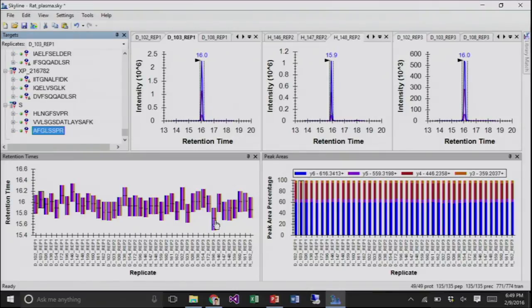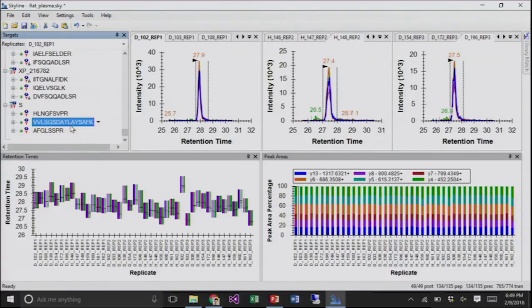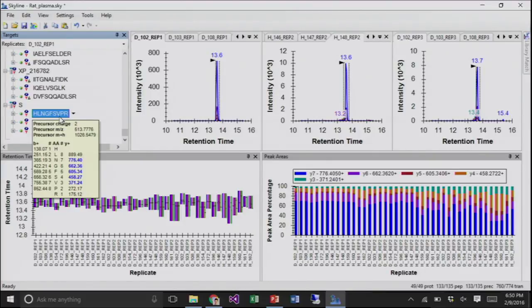If you're a curious kind of person, you might click on this one and go, oh yep, there's really nothing else, so I guess that's it. So that looks okay. Let's look at the next one. Anybody have any issues with how this one's integrated? Maybe look at this other thing that's sticking out. This is again the one that I said is kind of always sticking out. Looks pretty good. Everything's quite good over here. So for the first two, we think things are looking pretty good for us. Click on the next one. Anybody see any issues?